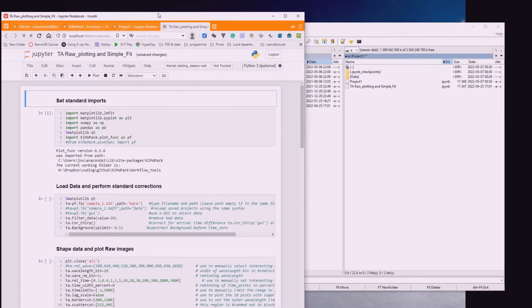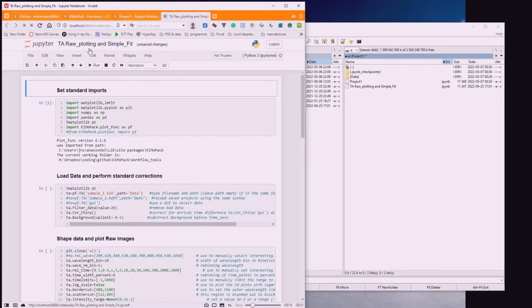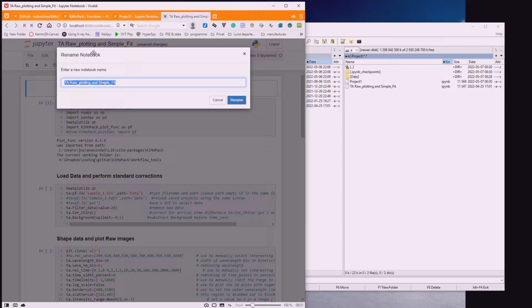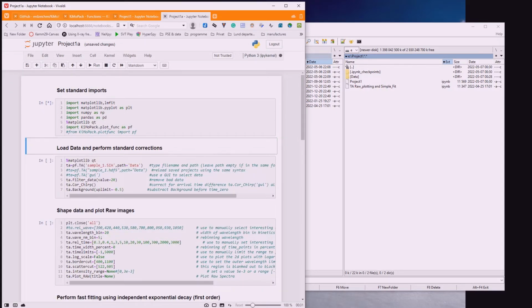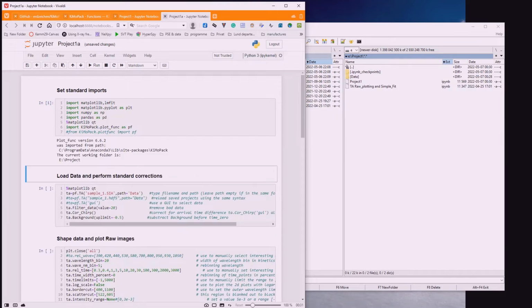I always rename the workflow tool to represent my project, and to create a unique record. You start by loading the files, confirming yes, the newest module, you are in the project folder where you believe you are, and you open your file.